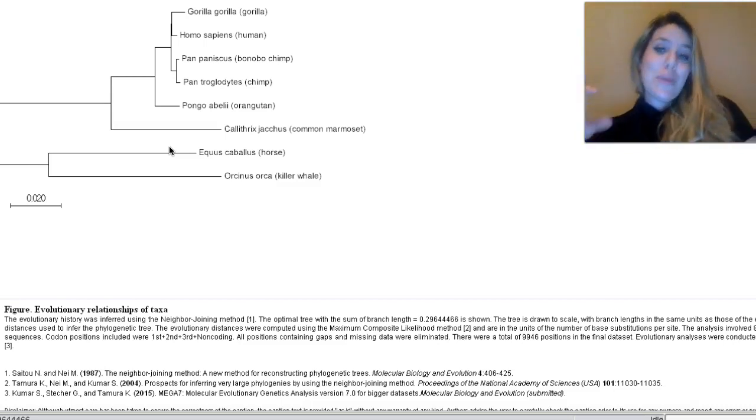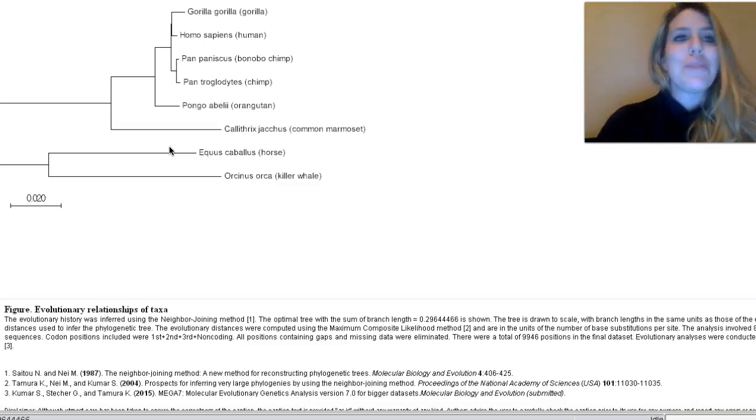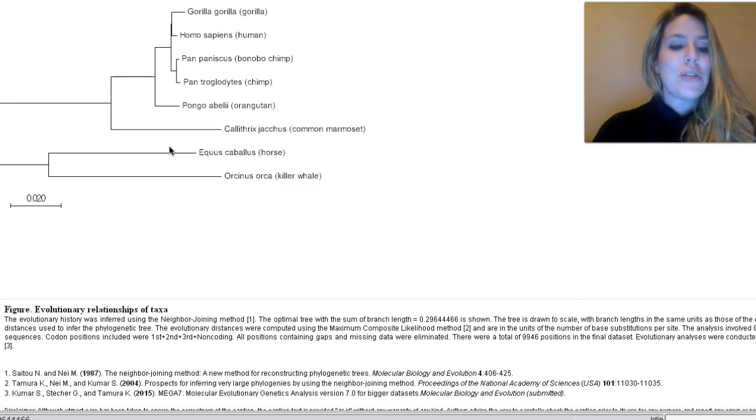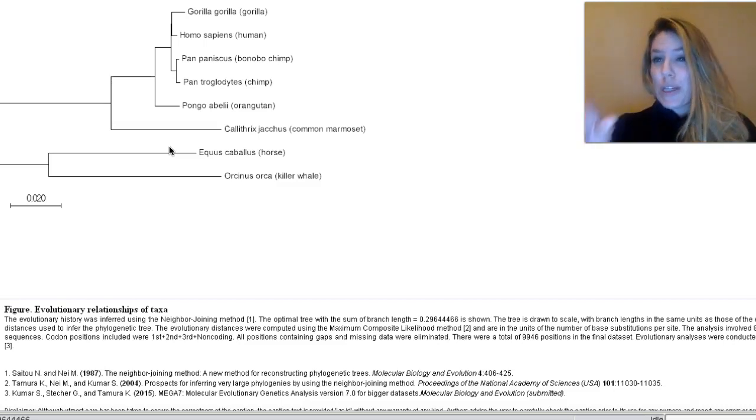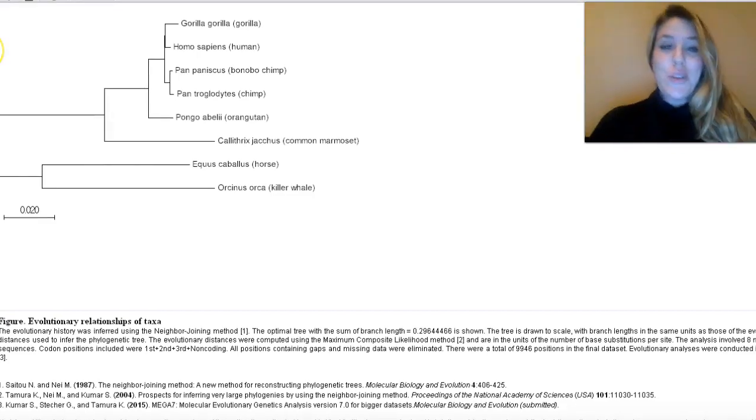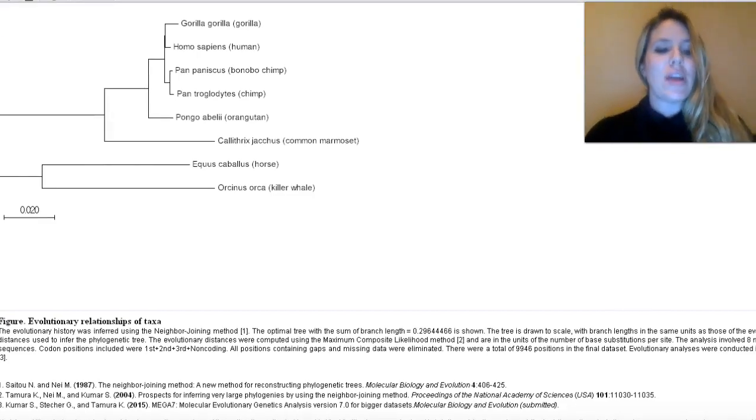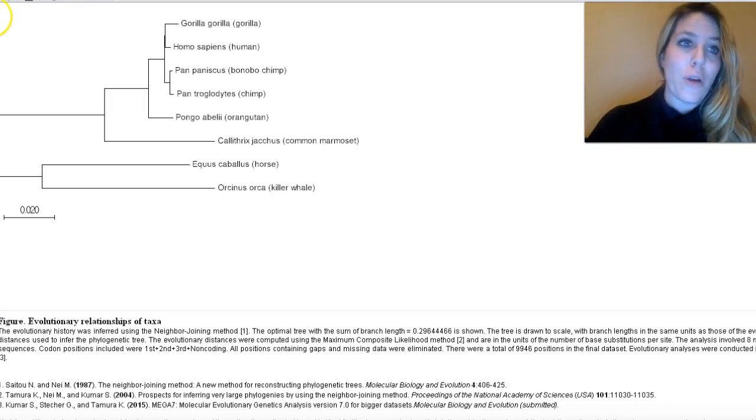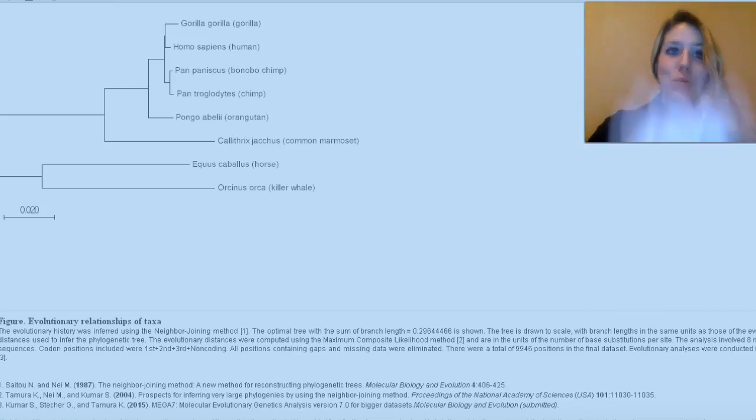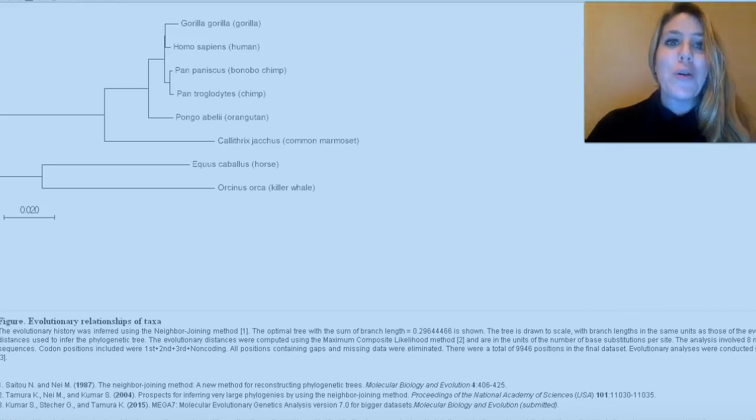To take a picture of your phylogenetic tree, we're going to stick it into a PowerPoint slide so we can manipulate it further. If you're using Windows, just hit shift print screen. On a Mac, it's really easy to take a screenshot. You just hit shift command and four, then you get this little thing that pops up. Hit the spacebar and that will take a picture of the entire screen.